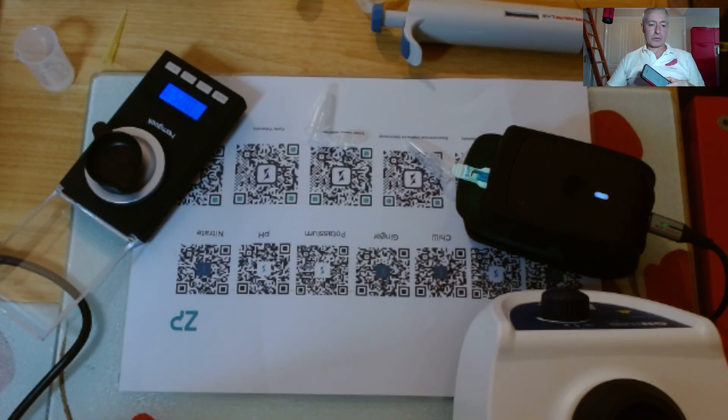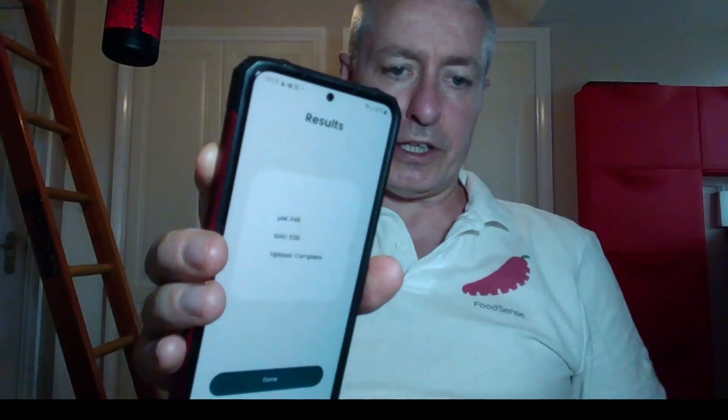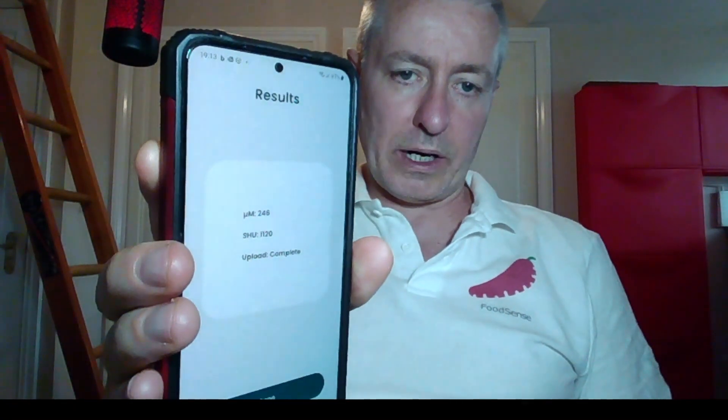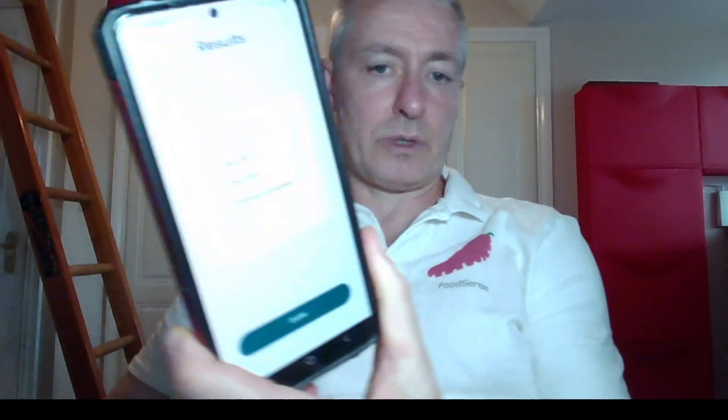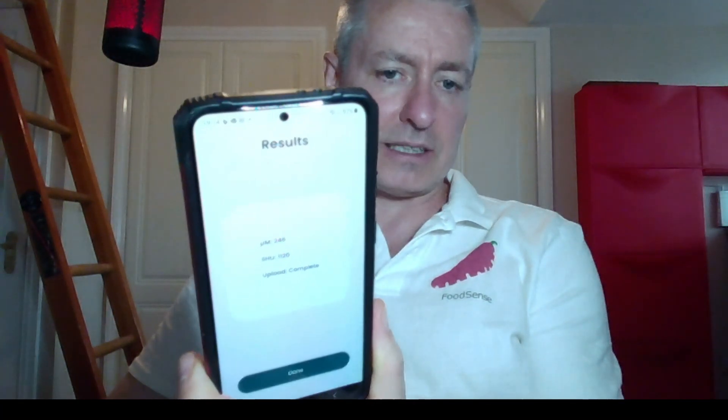So it's come back and I will show it to you. Let me just change cameras really quick. So it's come back and it said Scoville heat unit 1120. And it also says uploads complete. I'm just quickly going to a browser on my laptop. So it's given me a result on my phone, and that's easy now – you can write down that result on your record.